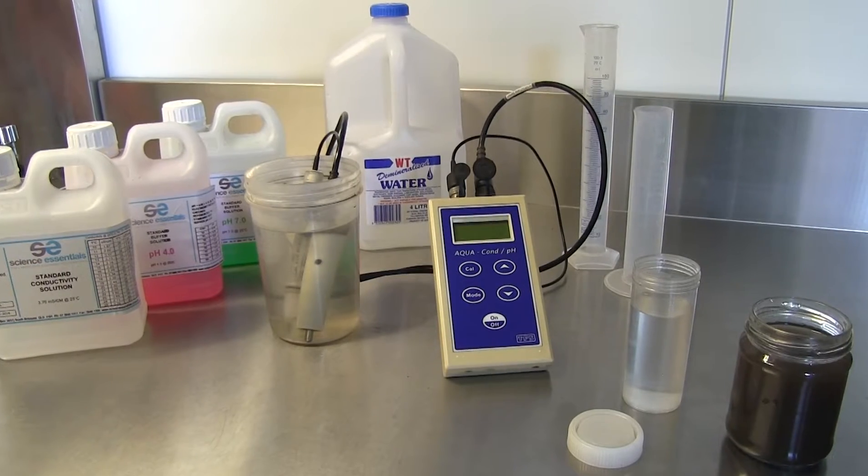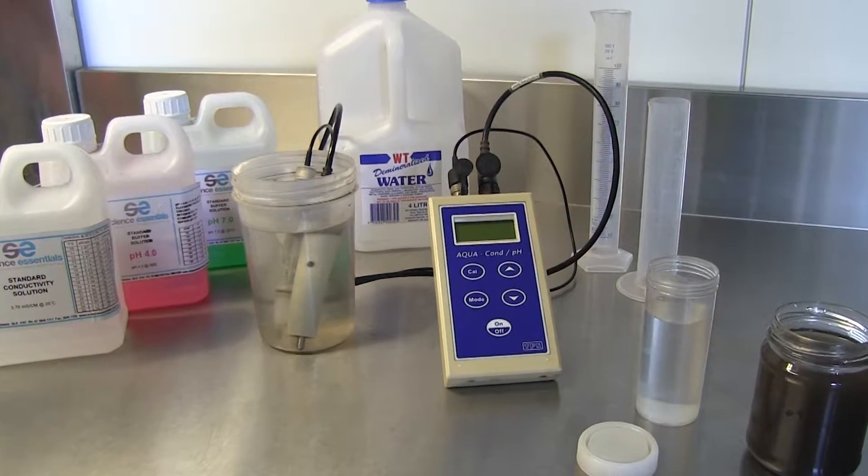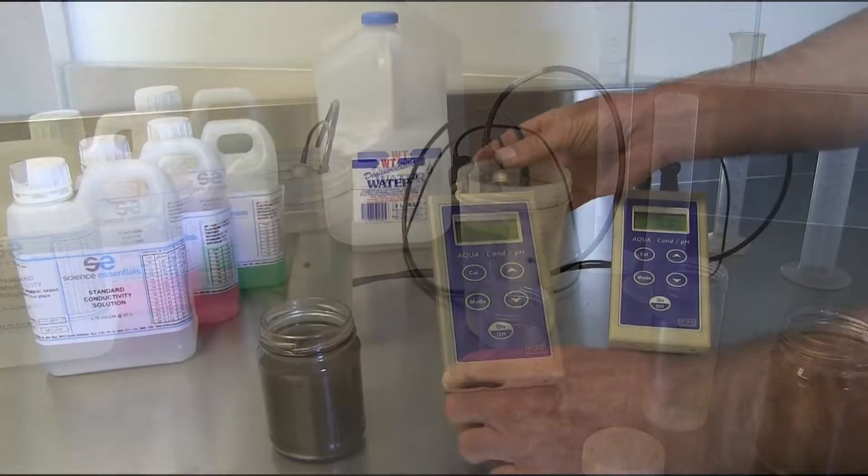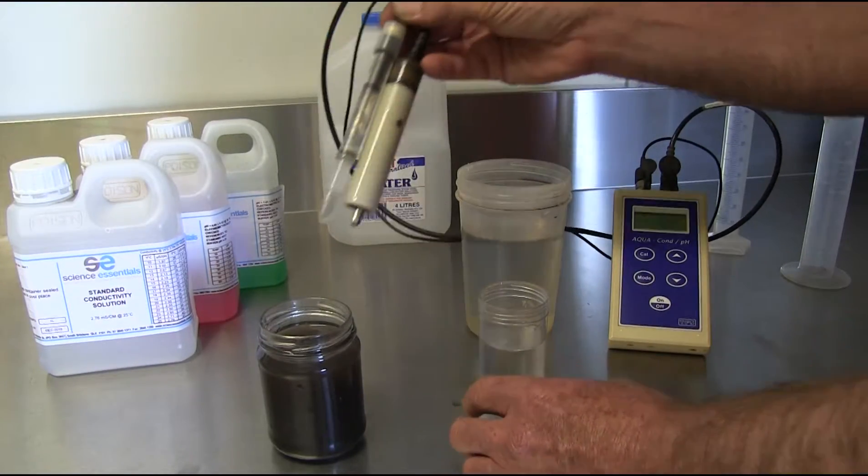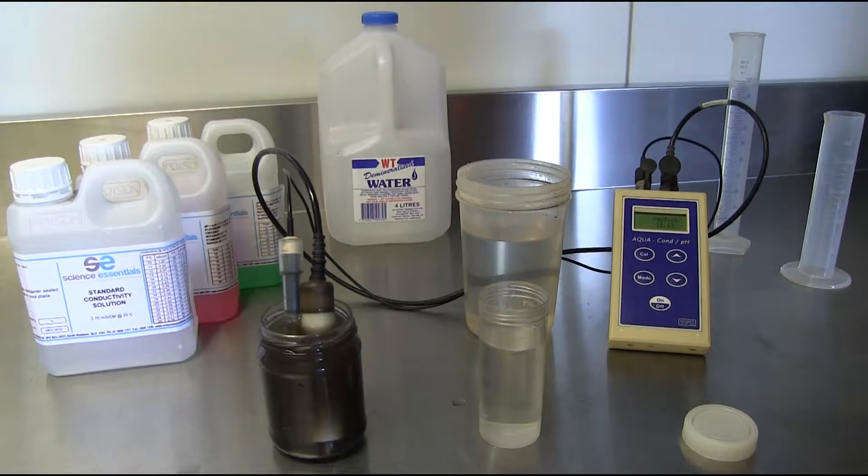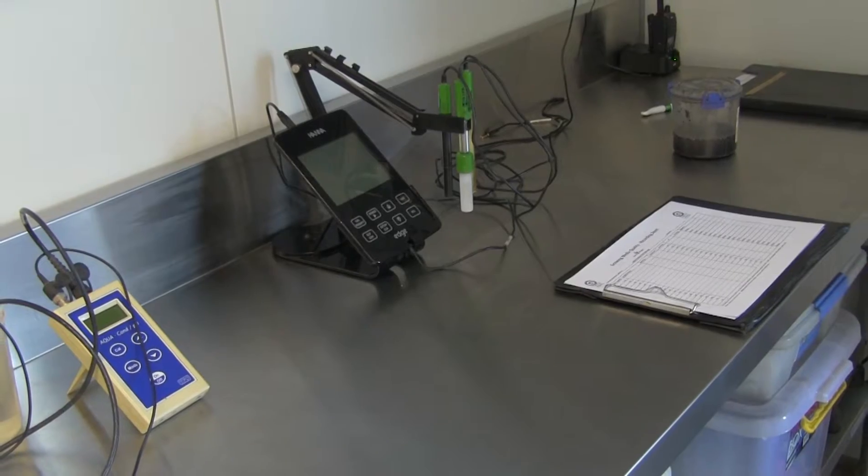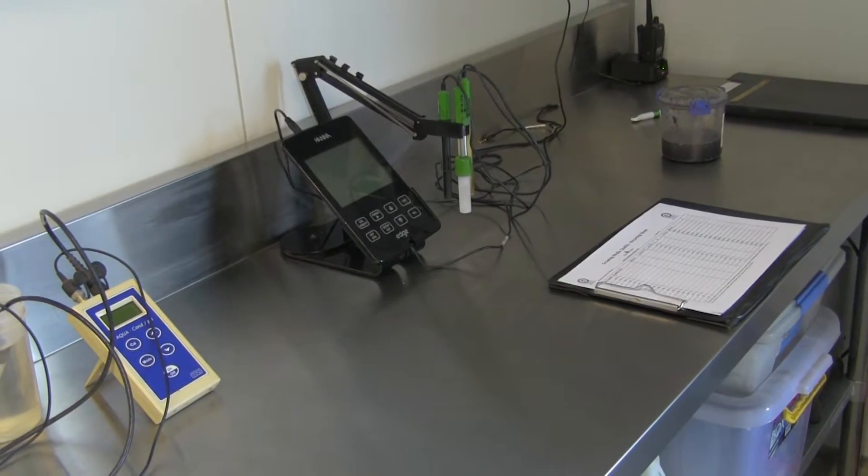To give the greatest accuracy, meters need to be calibrated regularly, with either the interval since the last calibration or the number of tests completed being used to determine how often. Ideally it is best to calibrate your meter before each sampling session. Alternatively, the following can be used as a guide as to how often to calibrate.